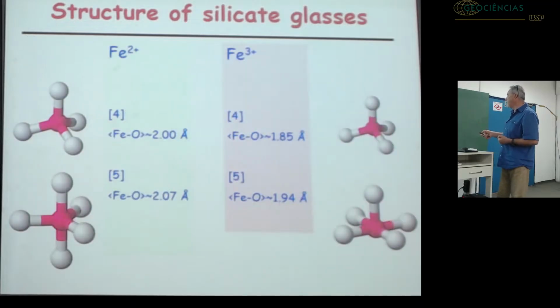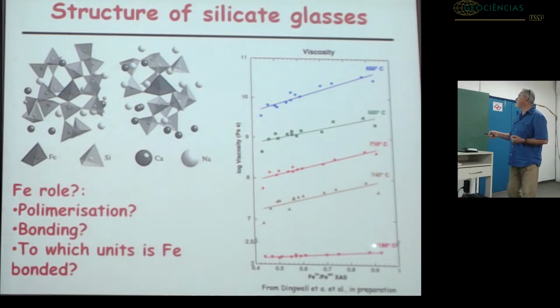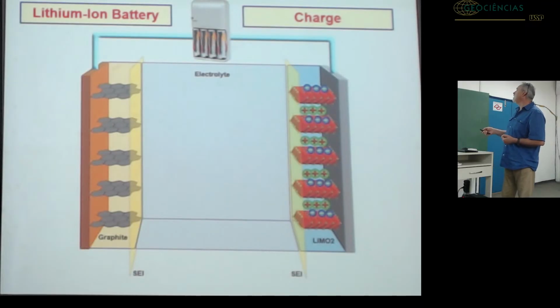How much it increases is a matter of temperature. So the increase is higher at the lower temperature. A few hints, in the time remaining to us, on a mineral material, a synthetic analog of a mineral, which is used in the field of lithium-ion batteries.